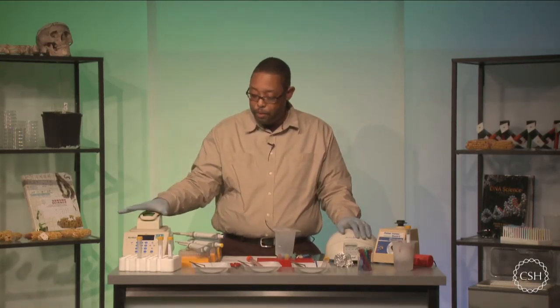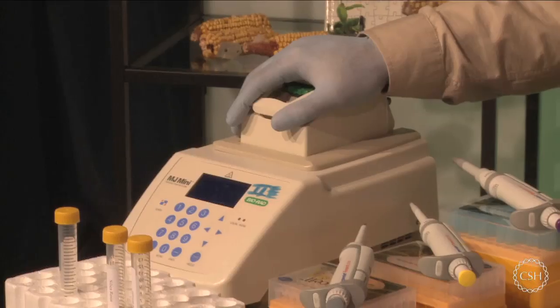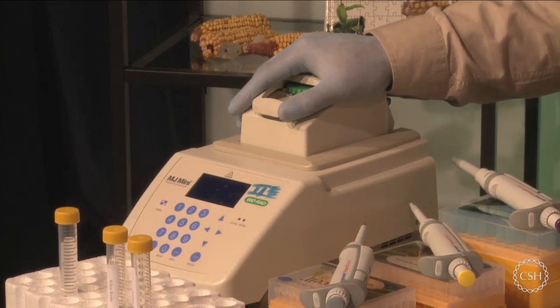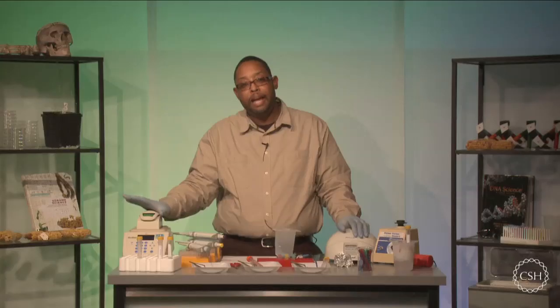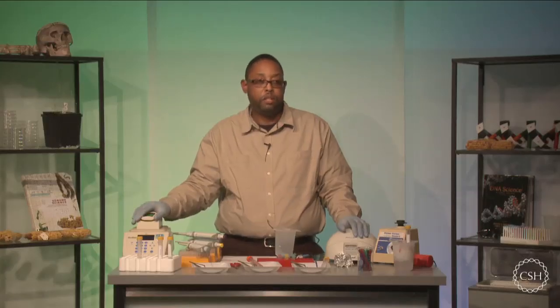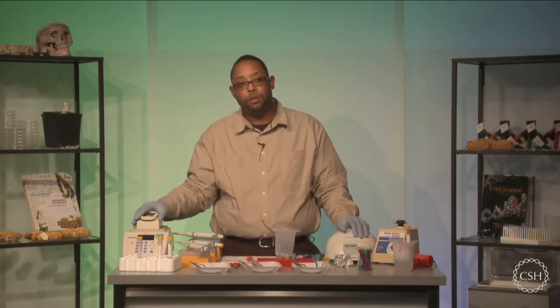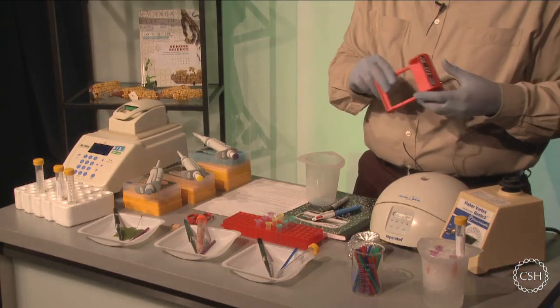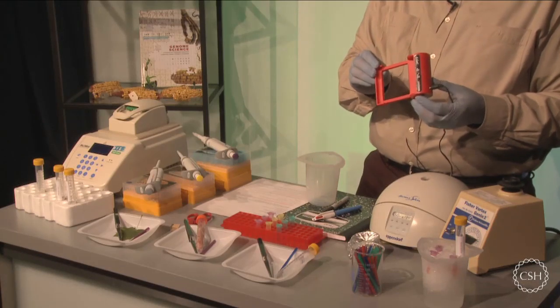Now, lastly, when you're done isolating your DNA, you can physically move over to doing PCR. I have a thermal cycler over here, but you can use any set of PCR reagents to amplify the target from your DNA. You will need a PCR machine to amplify the product and then lead to subsequent identification on some type of matrix, whether you have an agarose gel in the classical manner, or you will be moving on to using some other form of an electrophoresis box in which you can use a product like an e-gel, which is sold by Invitrogen.